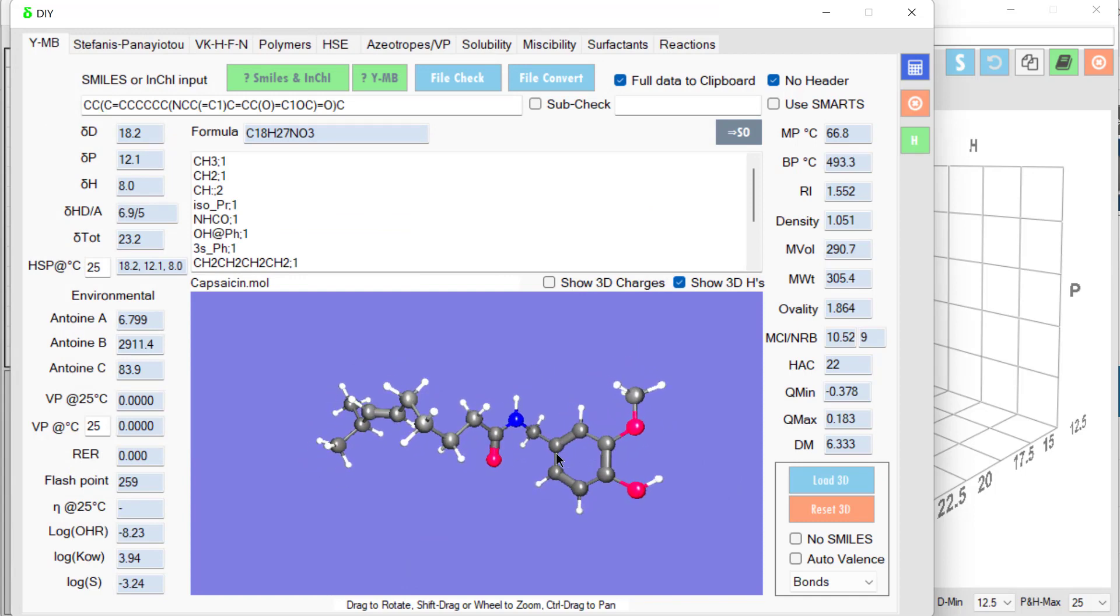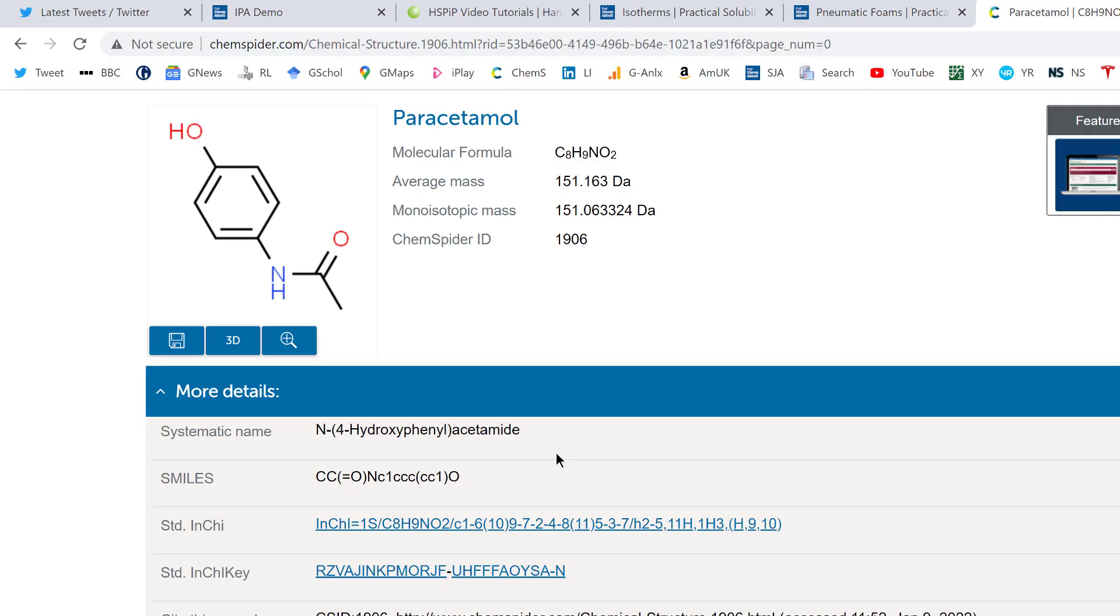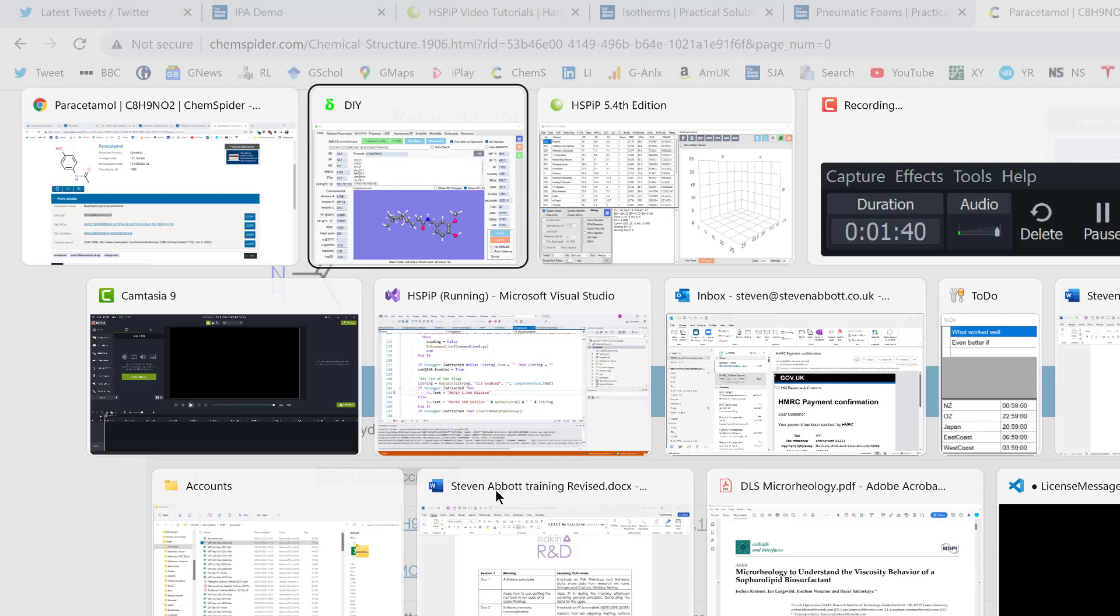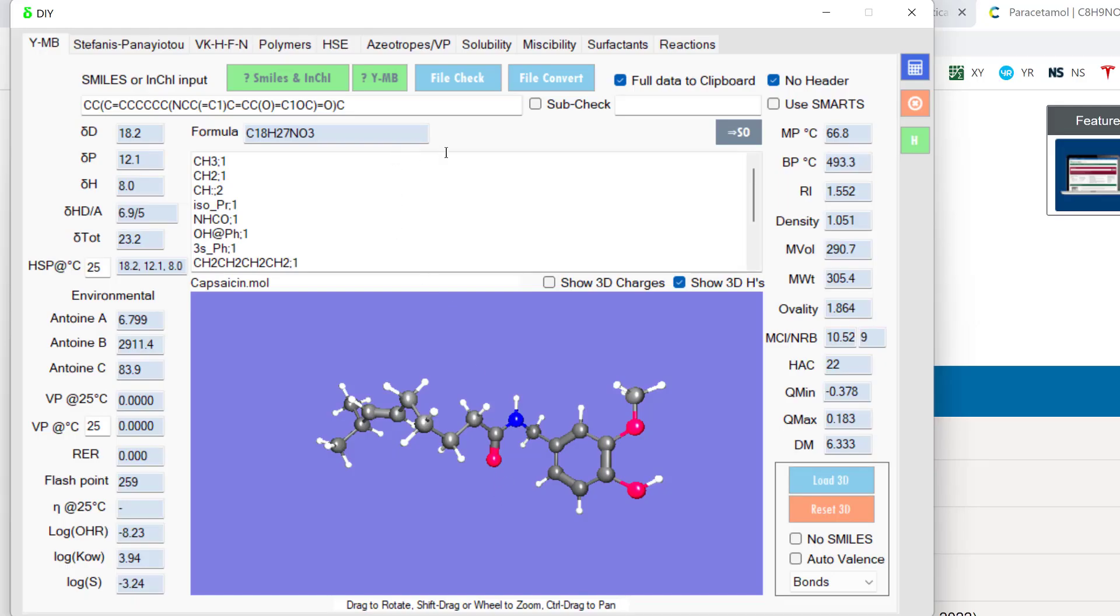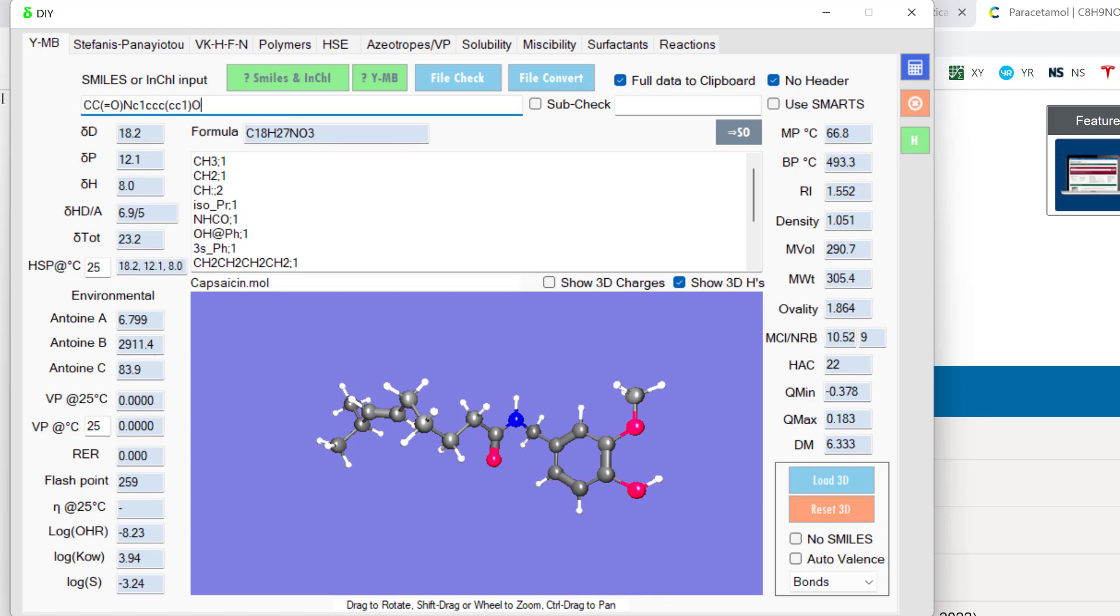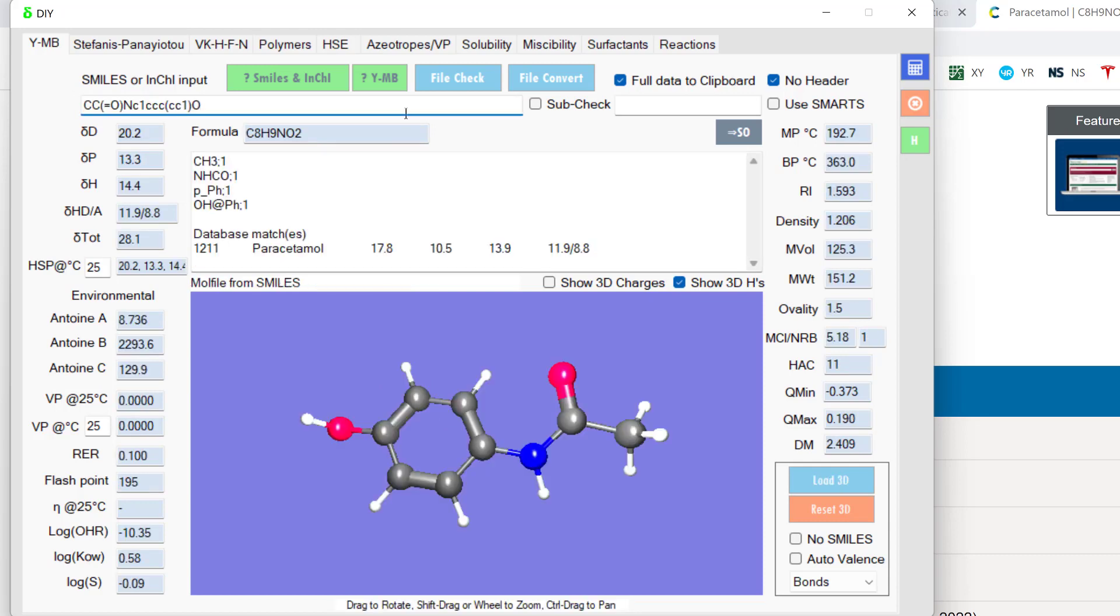Suppose we don't know the SMILES or don't have a mole file. No problem. We go to something like ChemSpider and I search for paracetamol and it tells me that here's the SMILES. I copy the SMILES. I go back to here. I paste the SMILES.